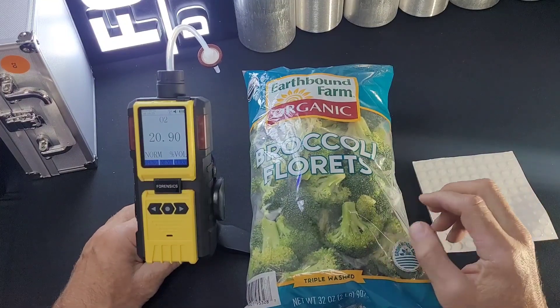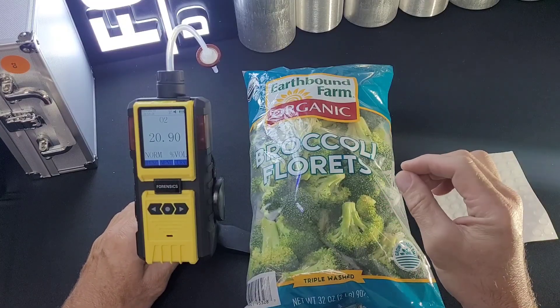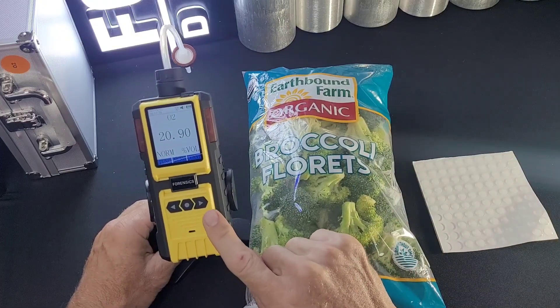Welcome to Forensics Detectors, a special application video on how to undertake a correct, proper, and effective headspace analysis with a Forensics Detectors Oxygen Headspace Analyzer.